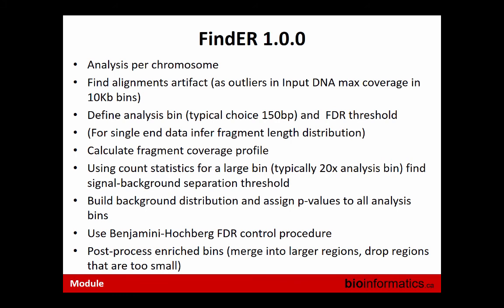Hoping to finalize. So what is the problem with those analyses? As Martin mentioned, this is a hot area for research. There's a big list, lots of papers, even comparing multiple tools; there are maybe 50 different tools, all dealing with calling enriched regions for ChIP-Seq experiments. They all have different flavors and different focuses. Some of them are funny.